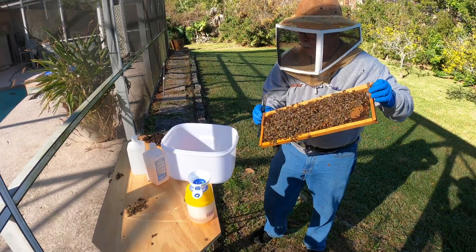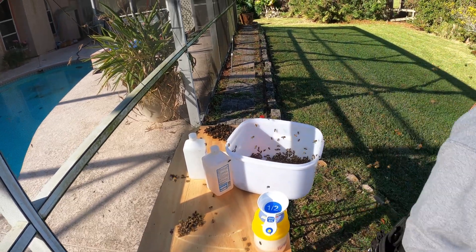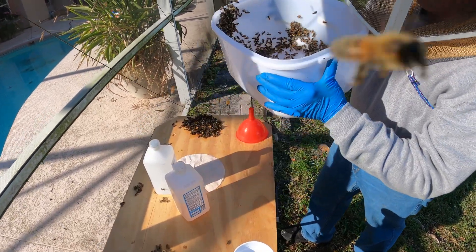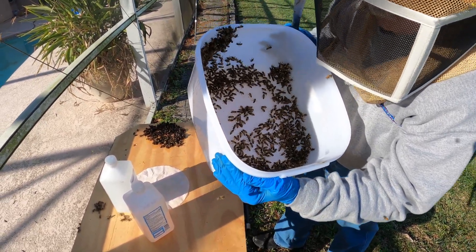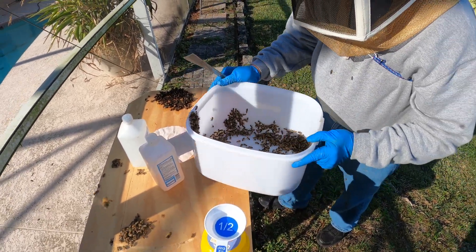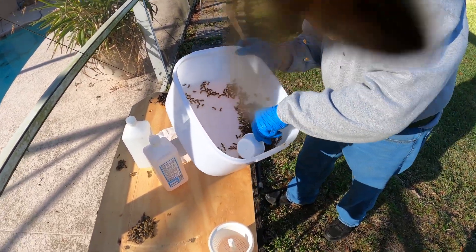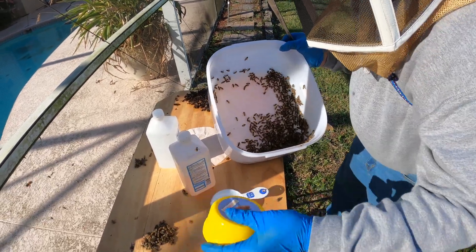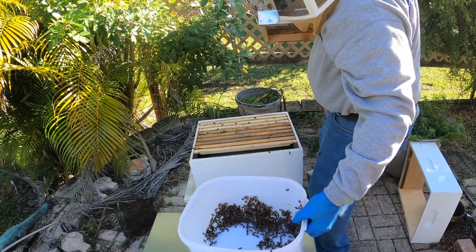Shake your bees into a container — preferably a white container because it's easier to see. Look again for the queen. Let the container sit for a few minutes; bees will fly off, and that's okay because the nurse bees can't fly yet — they're the ones sitting at the bottom of the container. If foragers fly back, no problem. When you have a good group of bees, give it a thump to get them into the corner, scoop out 300 bees, and drop them into your alcohol shaker bottle. Set the lid on top, and that's a good time to put the hive back together. The remaining bees can be dropped back into the hive.